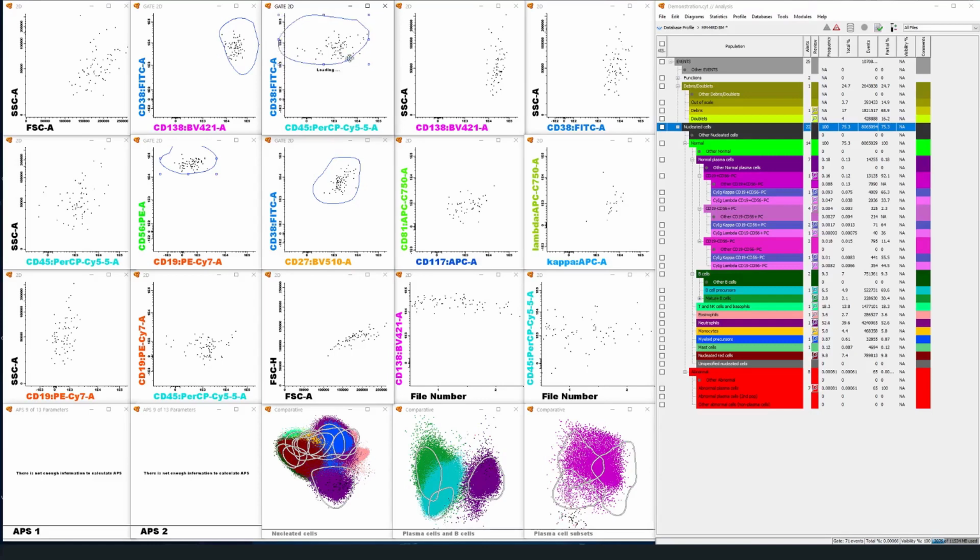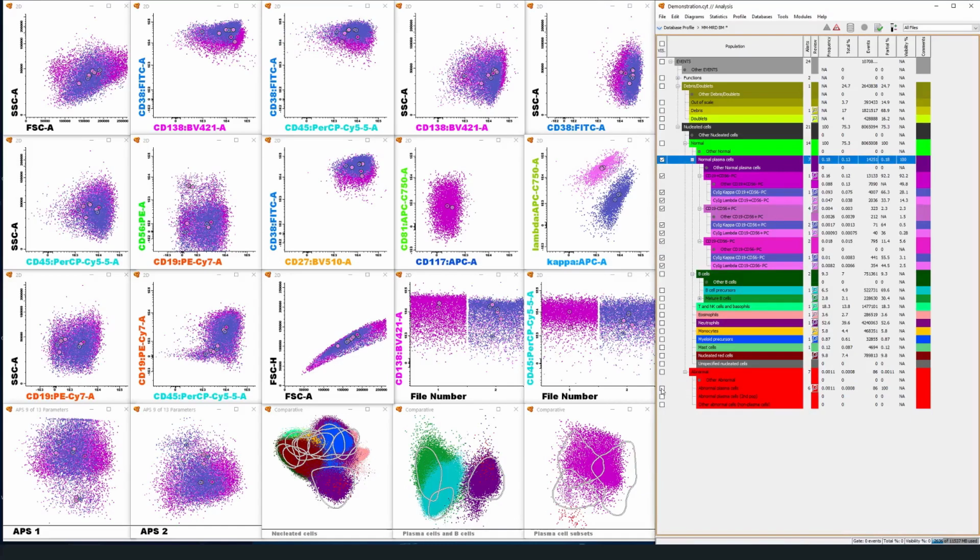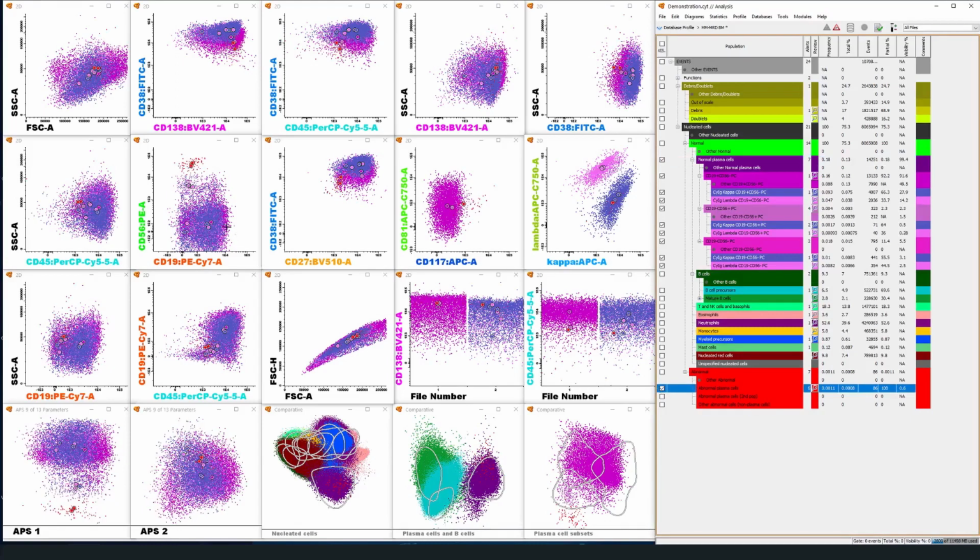So as I'm looking at this, this seems to be at least most of the bad cells, and you can see they have higher side scatter characteristics, dimmer CD45, dimmer CD38 than normal plasma cells. They seem to be clustered together, which is always a good sign of a bad population, and they only appear to be having kappa expression and CD117. So I think we can safely assign all of these towards abnormal plasma cells. From 65 events, I think it was, we go up to 86, which is not that much more, but it still makes it a bit more robust. And we can safely say that we have an MRD positive or detectable sample.